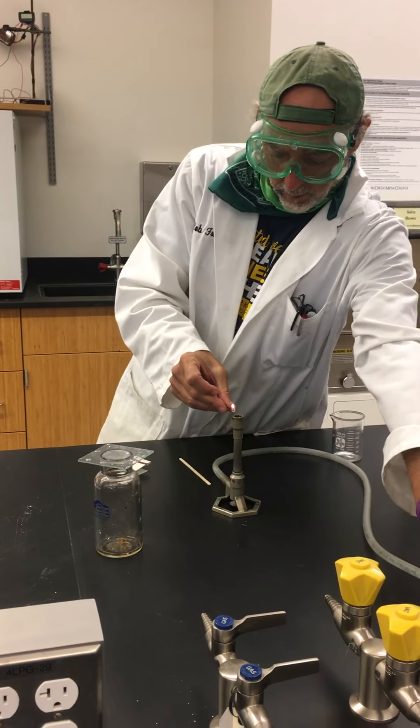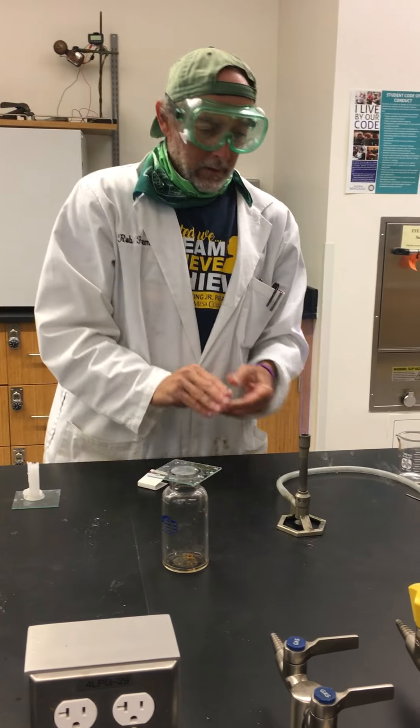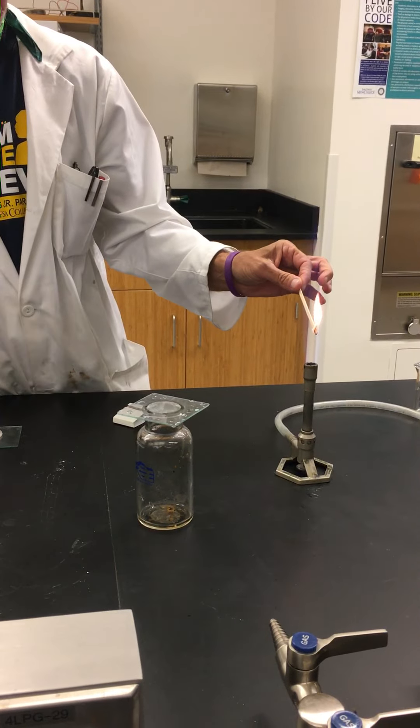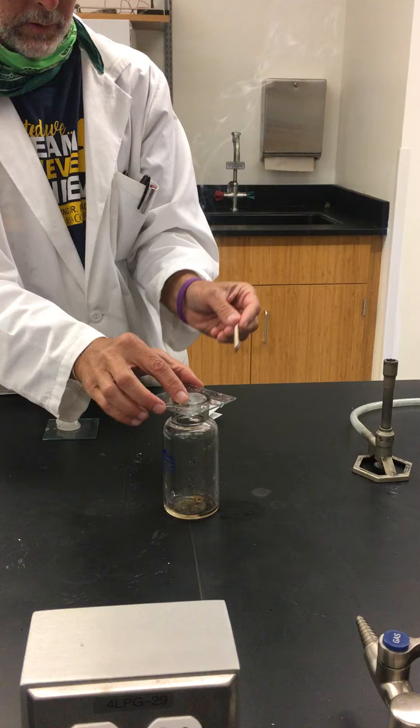This is burning. It's hard to light those with a match. Make sure your face is out of the way. So I'm just going to light this on fire. This is a burning splint. Now it's a glowing splint, but watch this.